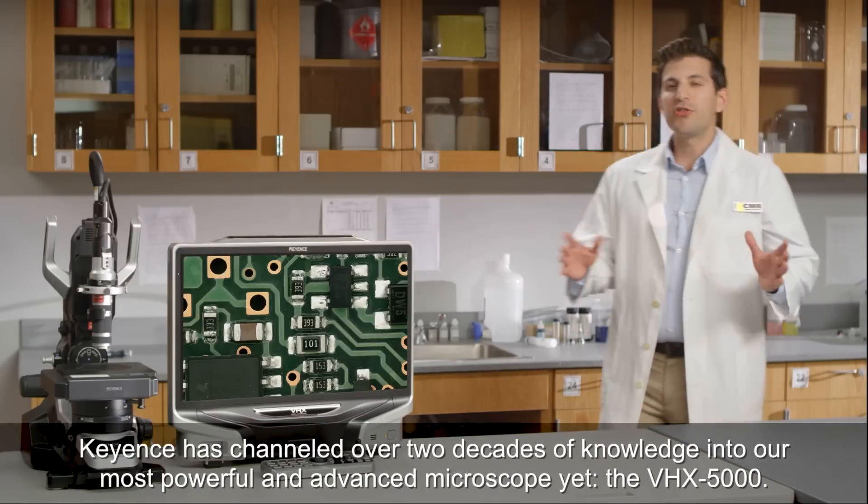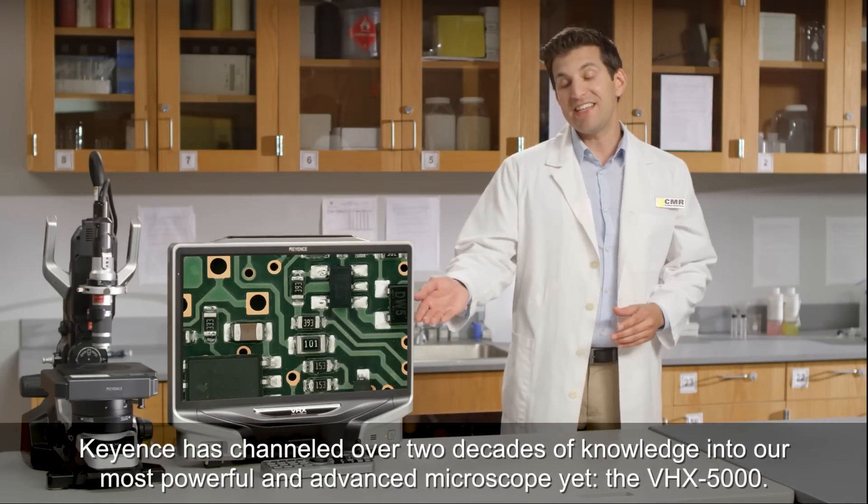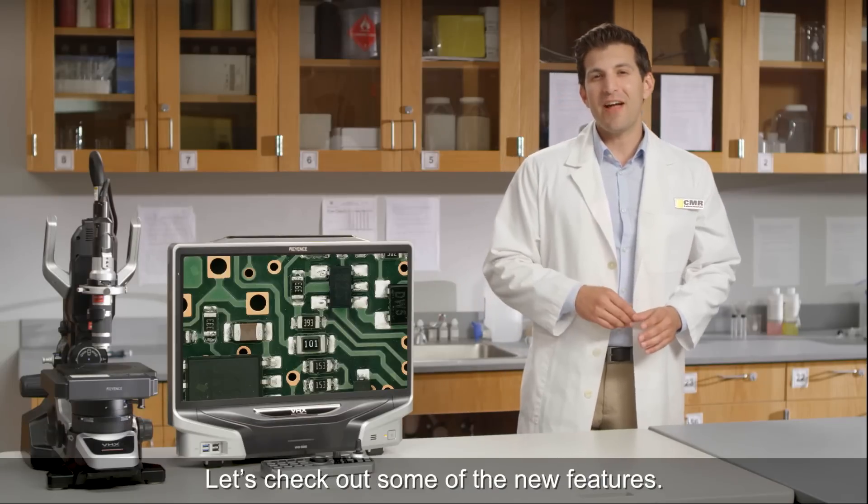Keyence has channeled over two decades of knowledge into our most powerful and advanced microscope yet, the VHX5000. Let's check out some of the new features.